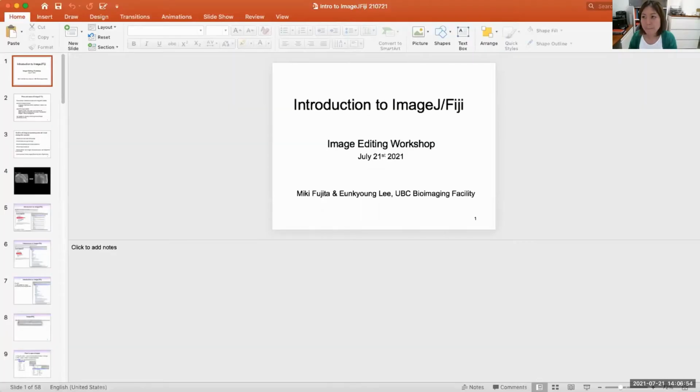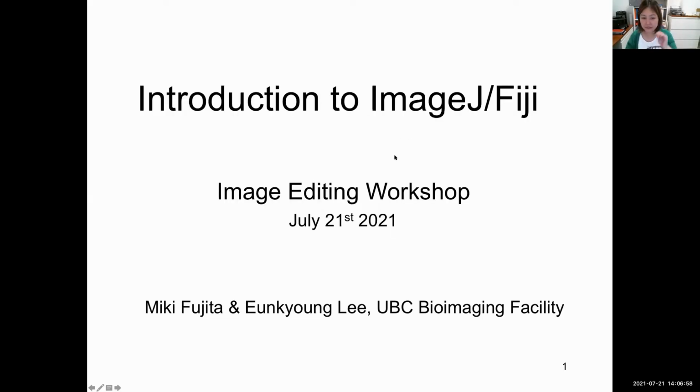I just want to start with sharing a PowerPoint slide. I'm going to be presenting this Fiji hands-on session, and you can ask any questions in the chat.